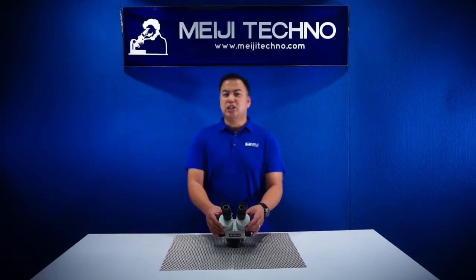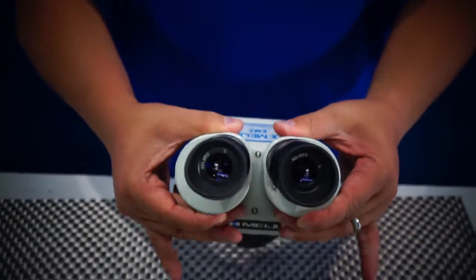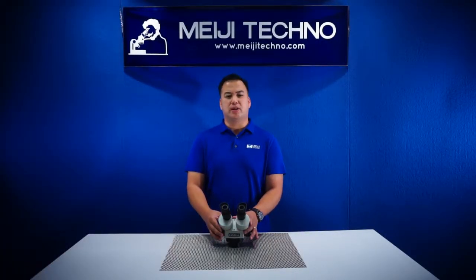The EMZ5's interpupillary distance adjustment is from 54 to 75mm and it has a base working distance of 93 millimeters. With optional auxiliary lenses, working distance can be changed from 32 millimeters to 230 millimeters.